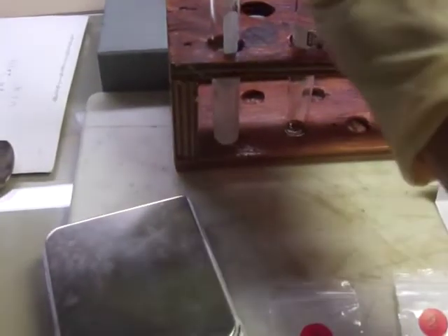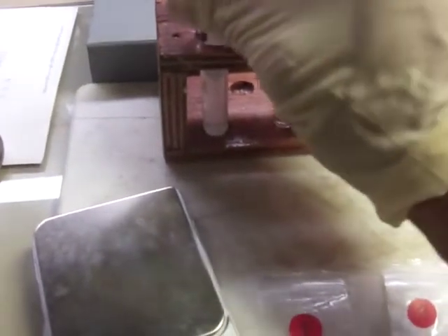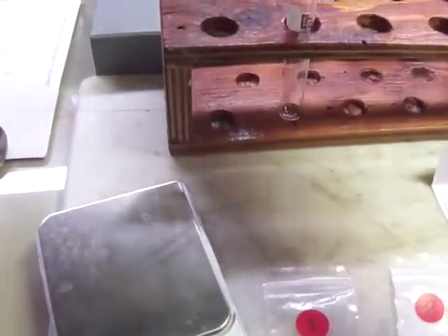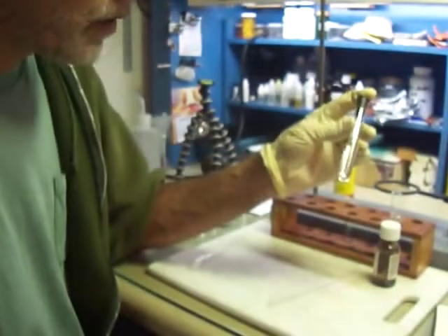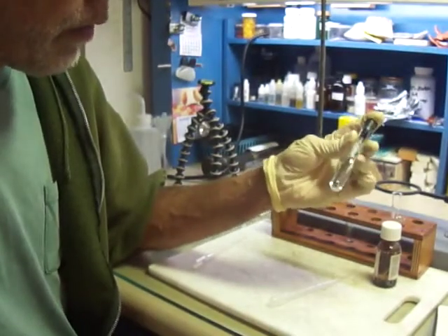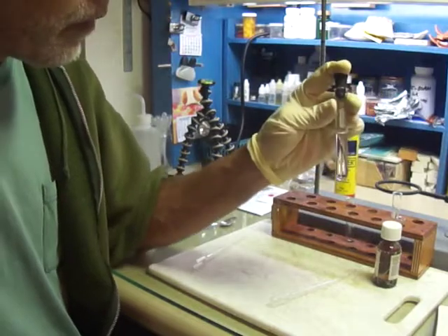And we'll give that a shake. And supposedly it's water soluble. I was told that. So we'll see if that's true and how easily it dissolves. So this material dissolved fairly rapidly and completely.